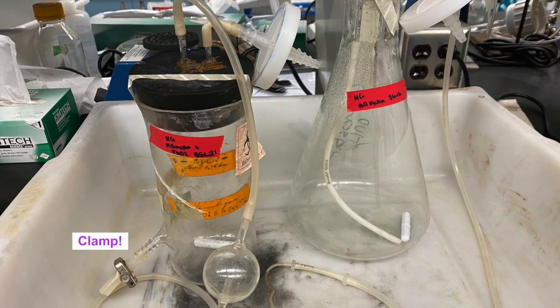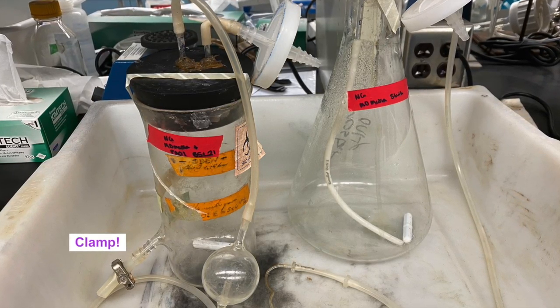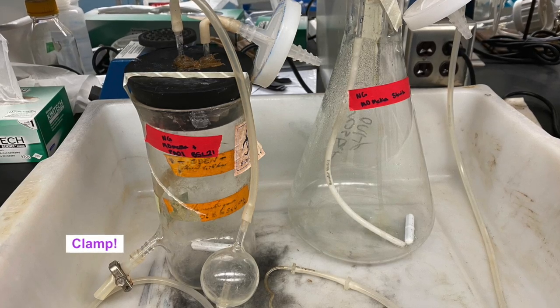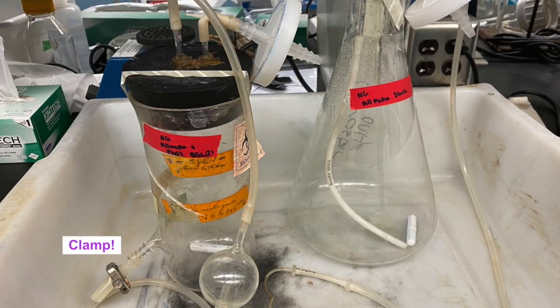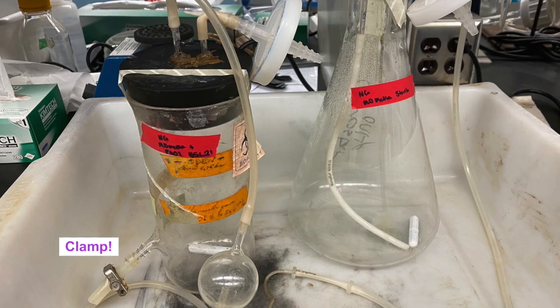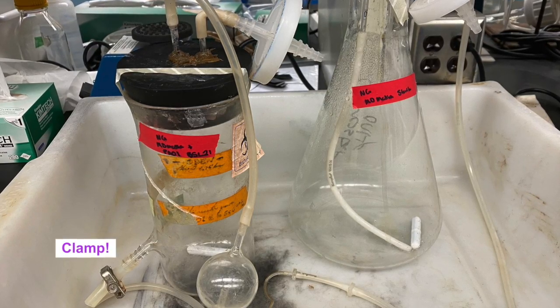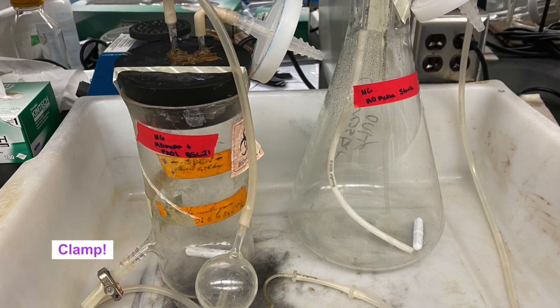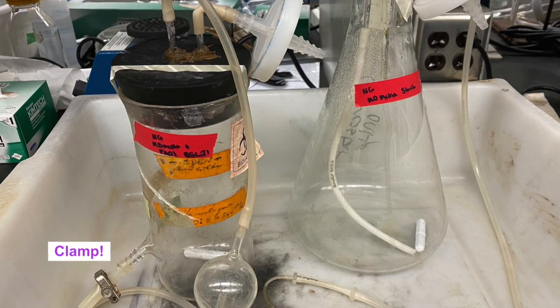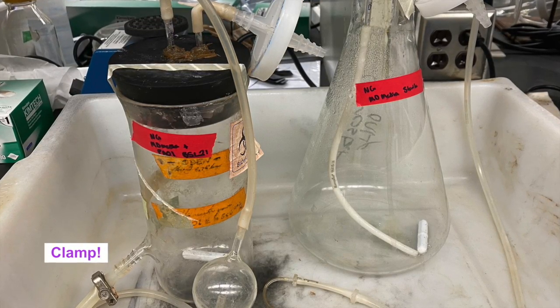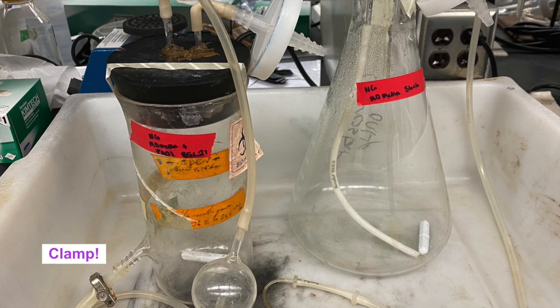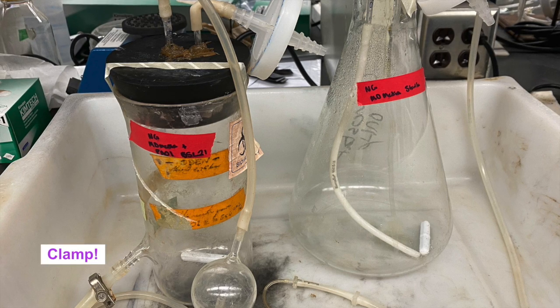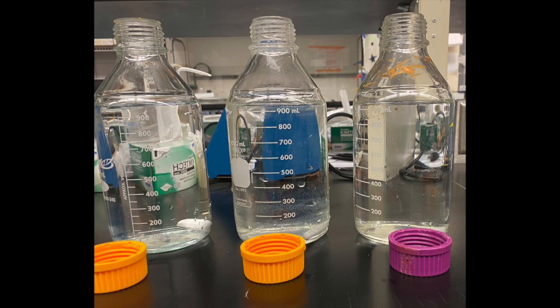Before autoclaving, a clamp will be placed on the growth chamber to prevent an influx of air entering the chemostat after we have removed it from the autoclave. Remember to use the correct autoclave setting and place autoclave tape on the chambers of the chemostat. Also, be sure to use an appropriate autoclave safe secondary container to hold your solids equipment.